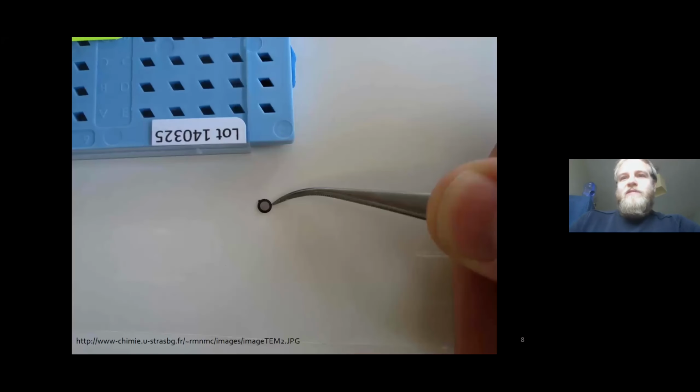I always thought it's quite funny that the electron microscopes are such big instruments, because this is what we're looking at. Maybe 3 millimeters across is a TEM grid, and this is where we need to put everything that we look at. So you can see we're not actually probing a whole lot of material, which is obviously one of the issues with TEM in particular: we're only seeing very, very small amounts of material at a time. So we need to generalize quite a bit.